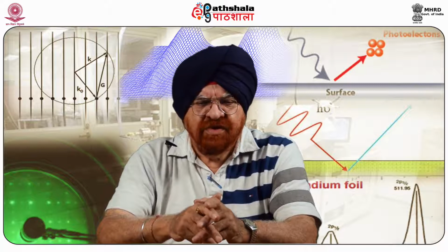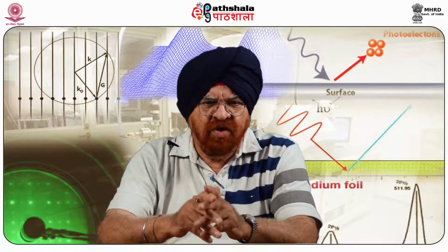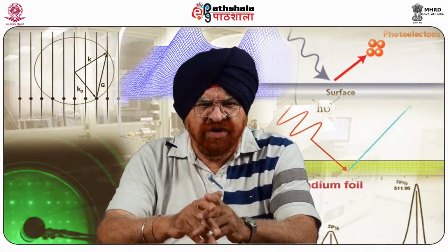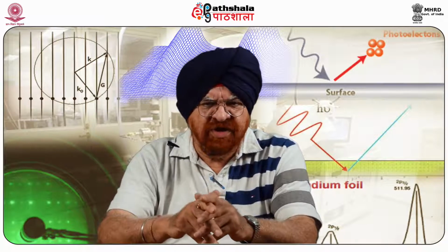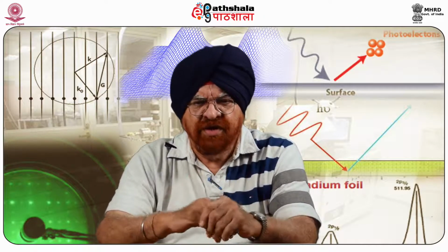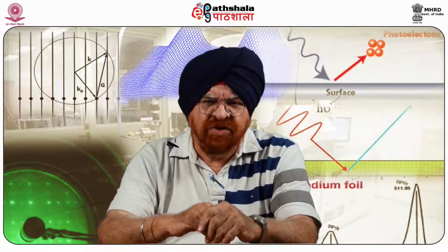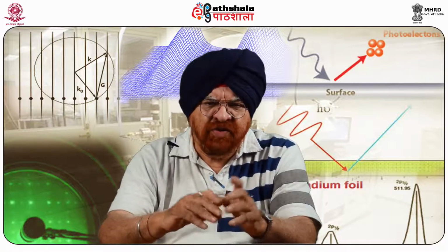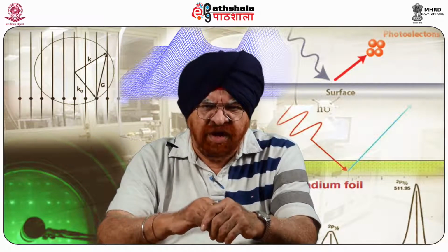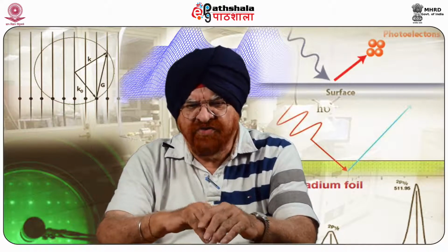For example, fracturing, cutting, or scraping in air or ultra high vacuum to expose the bulk chemistry, ion beam etching to clean off some of the surface contamination, and then exposure to heat to study the changes due to heating, exposure to reactive gases or solutions, exposure to ion beam implant, or exposure to ultraviolet light, would result in the moving out of an electron, which can be analyzed in terms of how much energy is needed to knock off that electron.